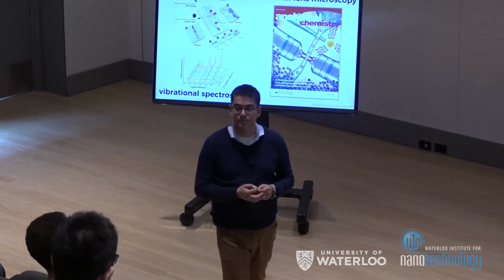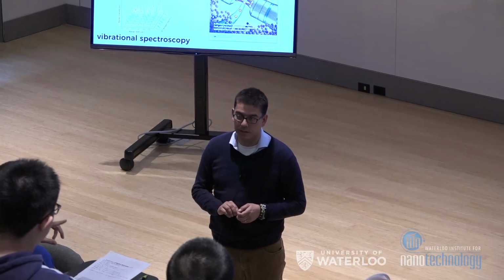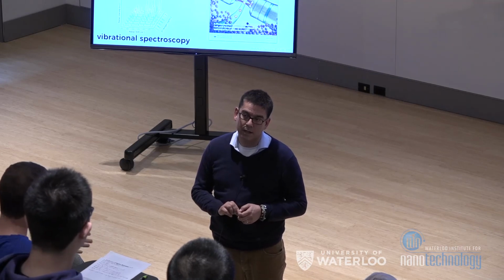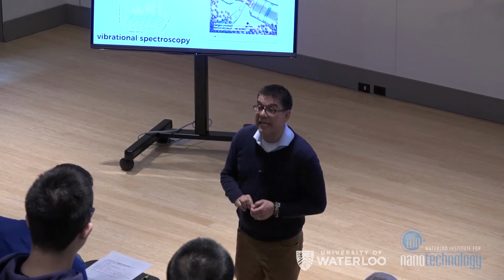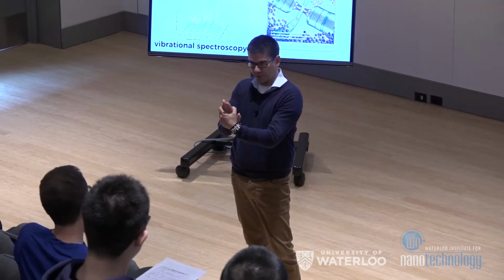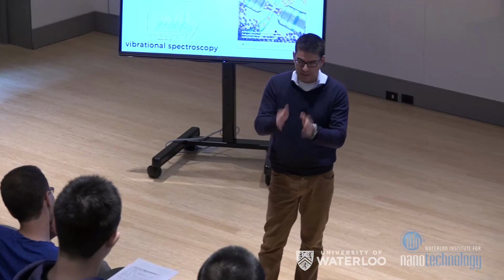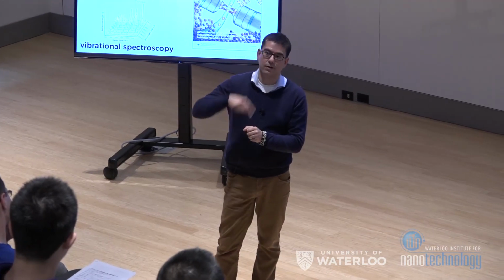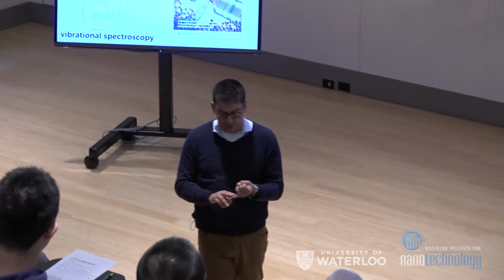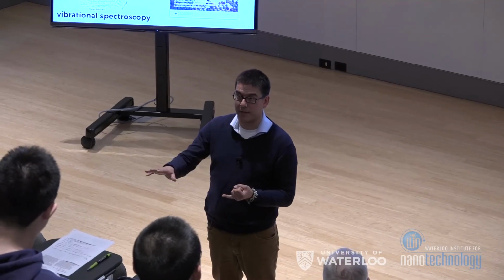I have a few questions. At the beginning of the talk, you were talking about a control system for synthesizing. So can you elaborate on what was the control system for synthesis of quantum dots? So the system simply started with the optical measurement. By measuring the wavelength, the width of the band edge emission, and the intensity, that told us how close we were to a result. If you want to know about the algorithms, I'm certainly not the best person to ask. So we were using SNOBFIT algorithms as a way of mapping parameter space.